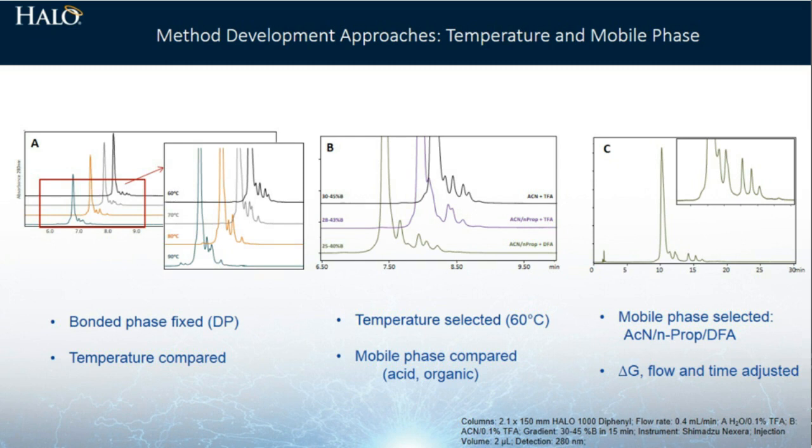We then somewhat adjusted the gradient conditions to get us to the center of our retention window, and looked at optimization with respect to the amount of that alcohol-acetonitrile mixture, as well as the use of difluoroacetic acid versus trifluoroacetic acid. Okay.